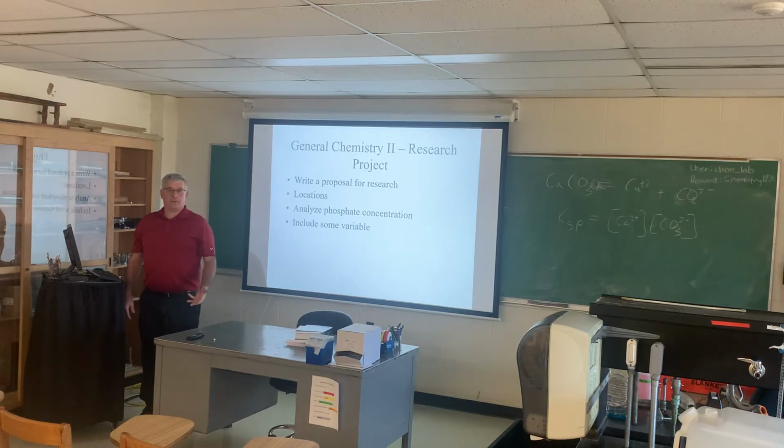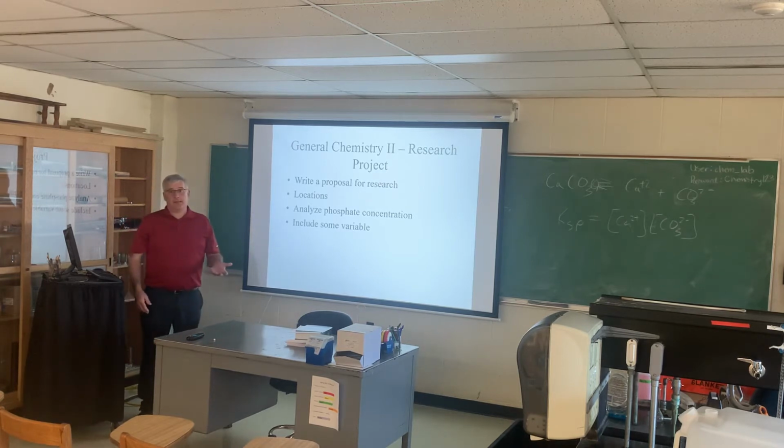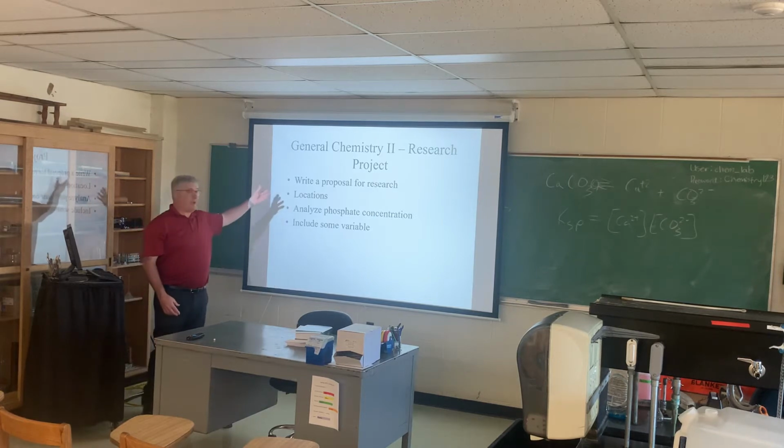Welcome to week 2 of CHE124 General Chemistry 2 Laboratory. This week we actually start a project which will last the entire semester. The project is the investigation of phosphate concentrations in the environment, and so we'll learn the technique to do that. And we'll also learn some other skills. We're going to write a proposal.